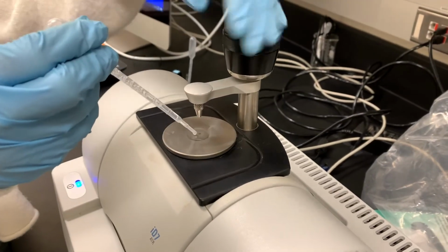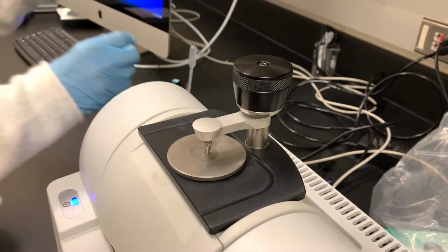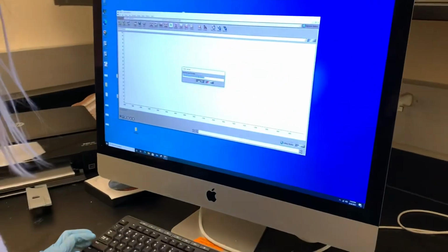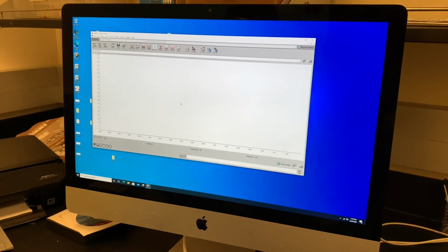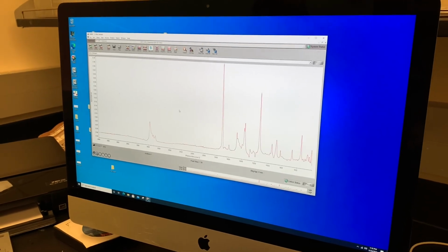This is a really smelly liquid, so that means it evaporates really fast, and so I need to work pretty quickly in the IR to make sure I get a spectrum captured before it all evaporates. I've already taken the background, and so we're just going straight to the IR.